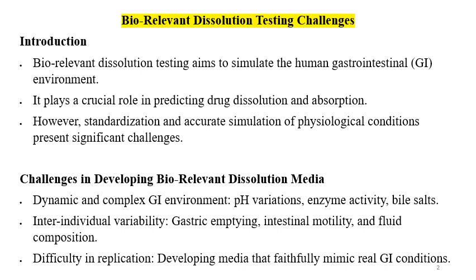So what are the challenges? How will you perform the biorelevant dissolution testing? By mimicking the GI environment, with simulations of the pH, enzyme activities, concentration of bile salts, and volume of GI fluid.